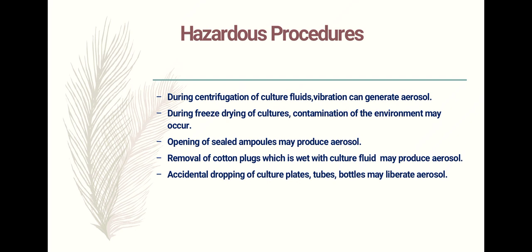Then freeze drying, a culture preservation method, which may also generate aerosol. Then opening of sealed ampules, that is, opening of cultures. If you bring cultures from institutions, either MCC or MTCC, and open the ampules, naturally the development of aerosol is possible. Then removal of cotton plugs which are wet.